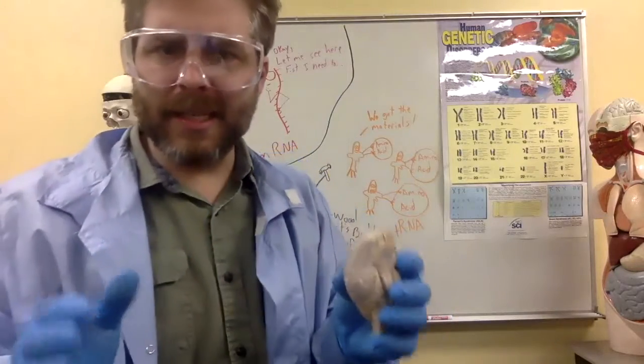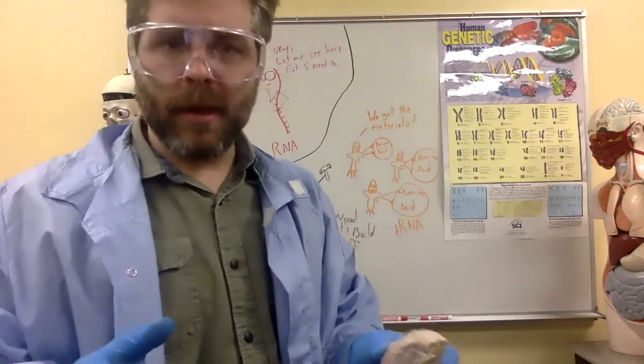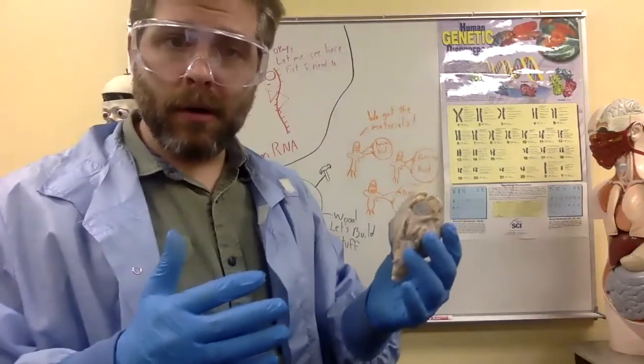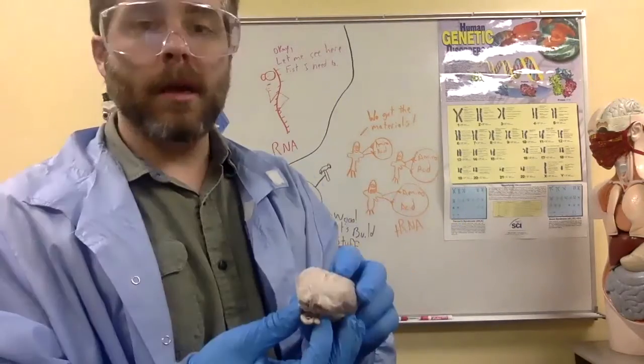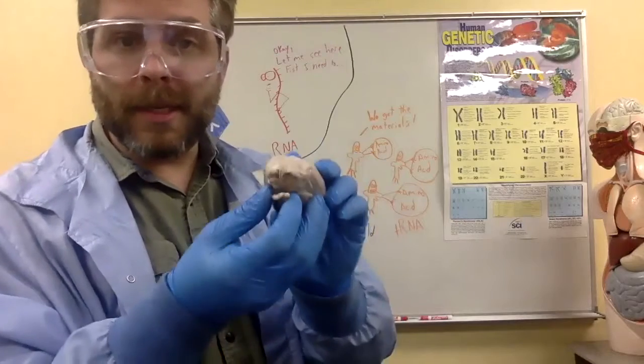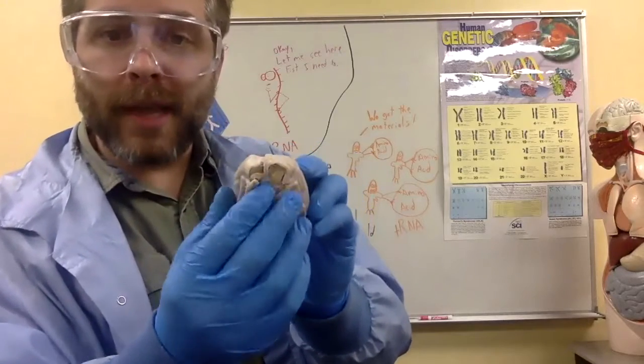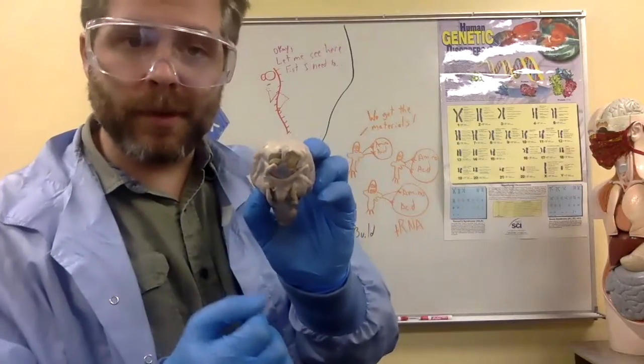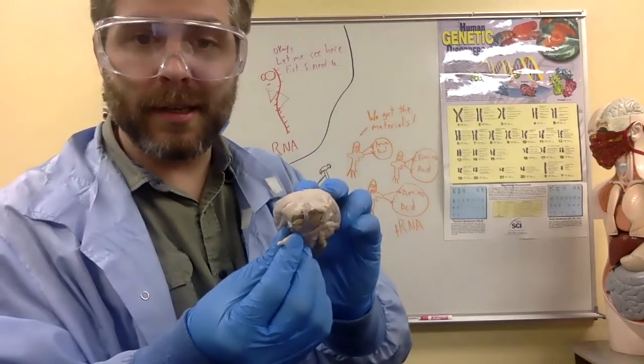So what does that suggest about sheep, about their senses? What would be stronger, a sheep's sense of smell or the sheep's sense of sight? Right, it would be the sheep's sense of smell, because they have much thicker nerves going in. They get a lot more information from their sense of smell than they do their sense of sight.